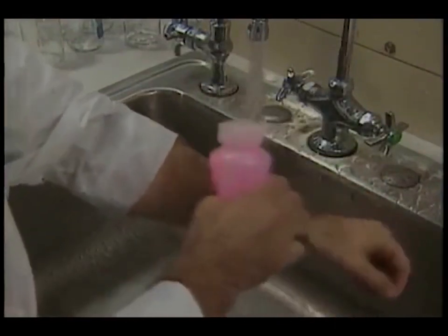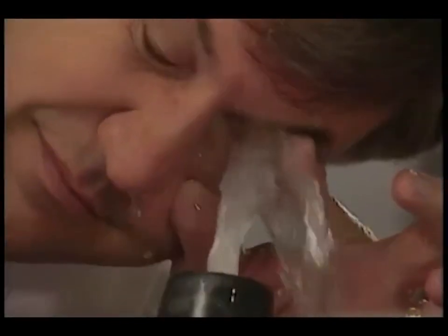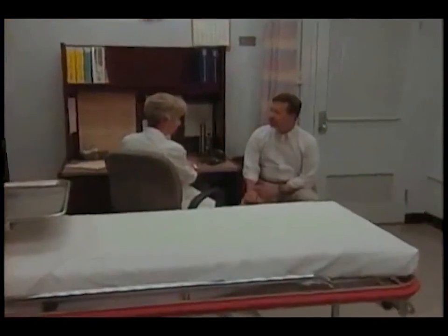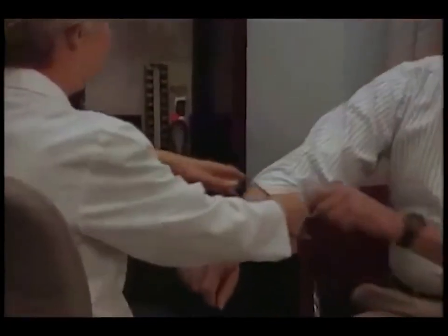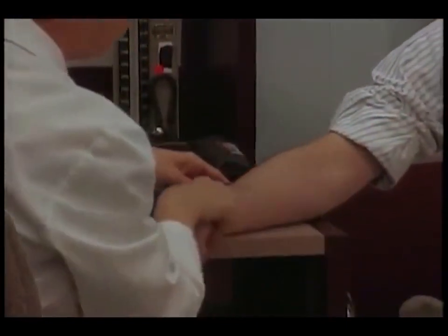A biological spill requires vigorous washing with soap and water, and splashes of hazardous materials to the eye call for continuous rinsing for 15 minutes. Cuts and puncture wounds, as well as eye splashes, should be given medical attention, and any exposure or injury should be reported to your supervisor.